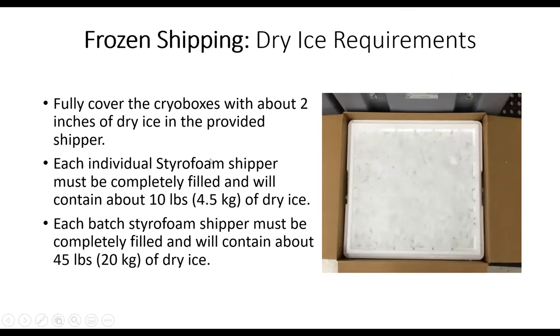For the individual or for the screening visits, it'll be about 10 pounds of dry ice. And for the other visits, it'll be about 45 pounds of dry ice. So please plan accordingly.